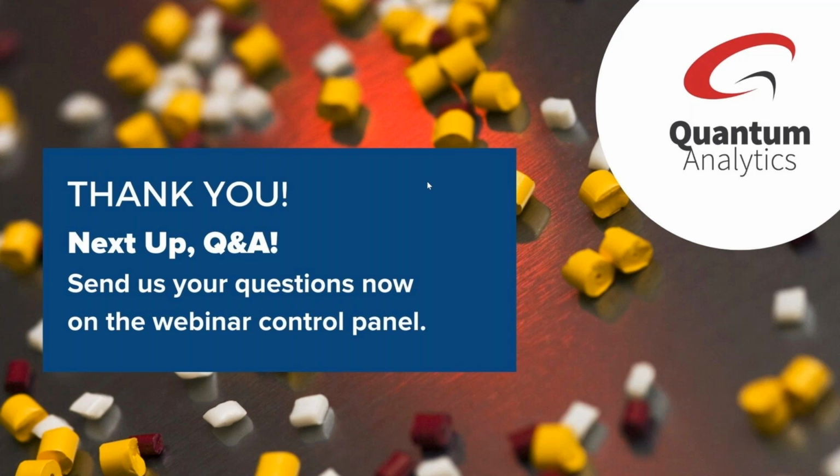But what it means is that even very, very small changes in crystallinity or polymorphism will shift the band a little bit. And if you look at the Raman, for example, we're at least an order of magnitude better than anyone else in the market. And that has advantage for looking at these small changes in crystallinity and polymorphism, because even very small changes will be picked up because the wavelength axis is so good on our systems.